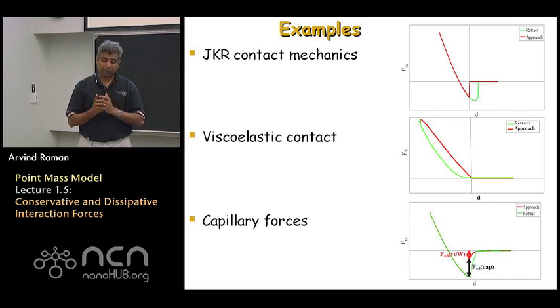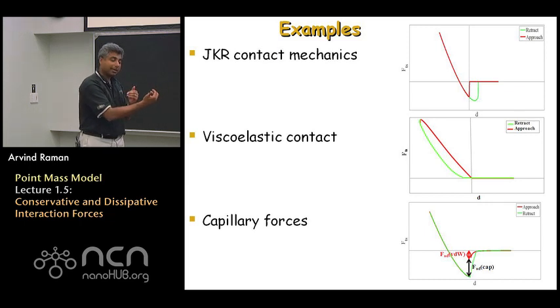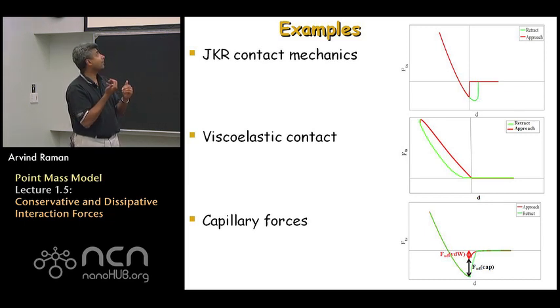So what ends up happening here, as you see on the top right, is the tip approaches the sample along the red line, and when it reaches contact, one suddenly develops a negative attractive force and goes in following a Hertz contact model. When one comes out following the green line, one has to move out further to a larger gap. In effect, the neck formed due to the very soft material wicks up, holding on to the tip.